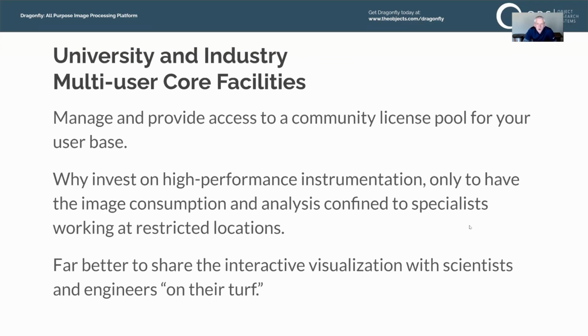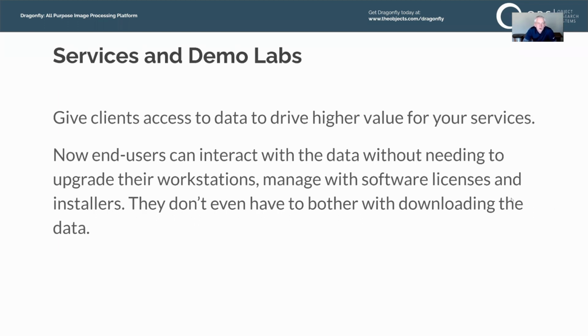It has a clear use case in university and industry multi-user core facilities. So this allows you to manage and provide access to a community license pool for your user base, which is something that core facilities are already in the business of doing. But why invest in high performance instrumentation only to have the image consumption and the analysis confined to specialists working at restricted locations? We think it's far better to share the interactive visualization with the scientists and engineers on their own turf. Let Dragonfly meet them where they want to do their work.